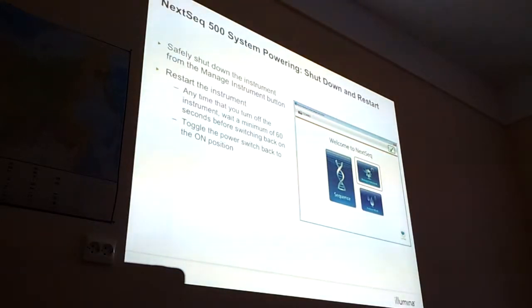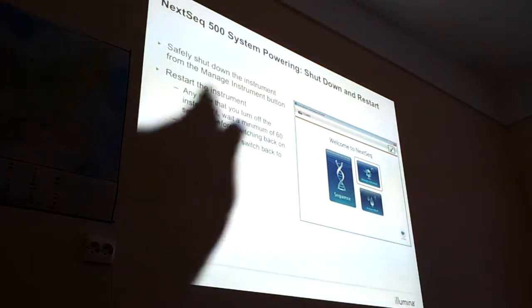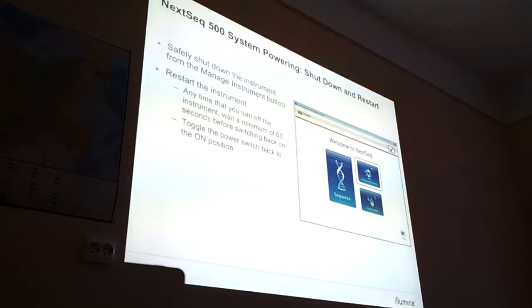If you want to shut down, you can use this Manage Instrument tab. But our general recommendation is to leave it on. For how long? Forever? Well, officially we say you should leave it on. To be quite honest, if it's for several weeks, I would switch it off. This is something I will ask my colleagues.